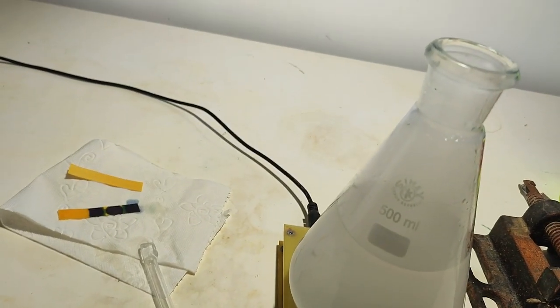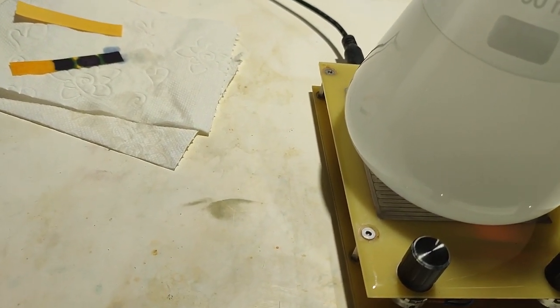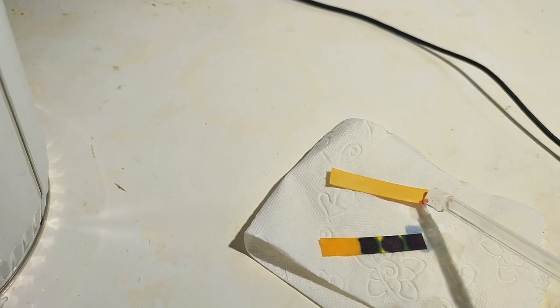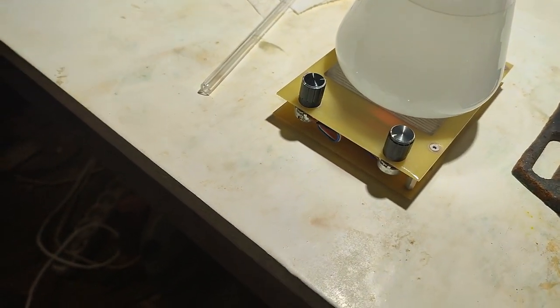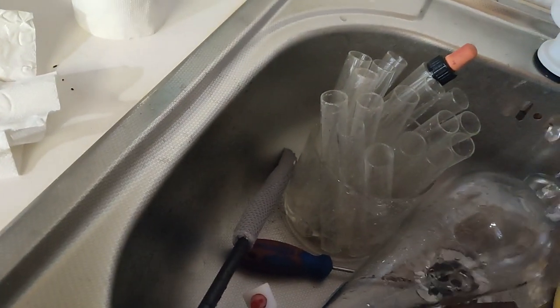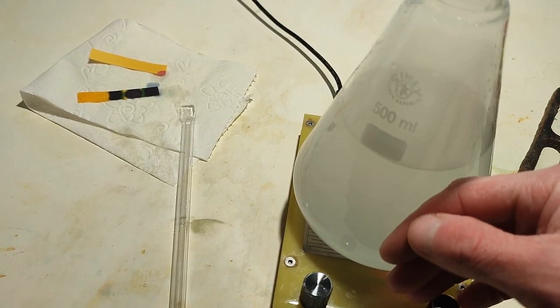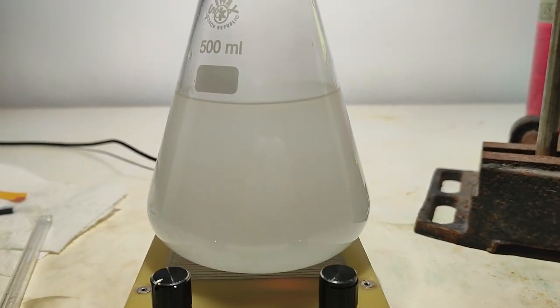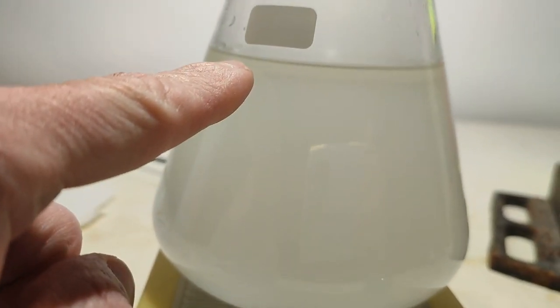Okay, another like 25 mils of HCl. I got it a lot. Now it's acidic. Okay, so that should be enough. But I will add a little bit more just to be safe. I need to extract this, but it is quite warm. Hopefully that won't be any problem. And you can see layers start to form.